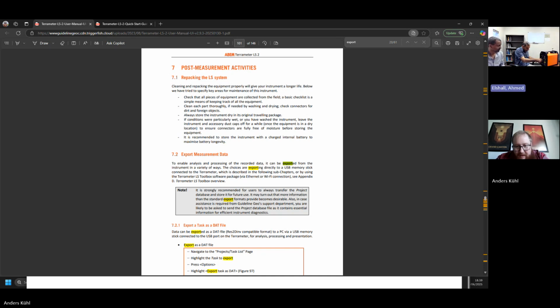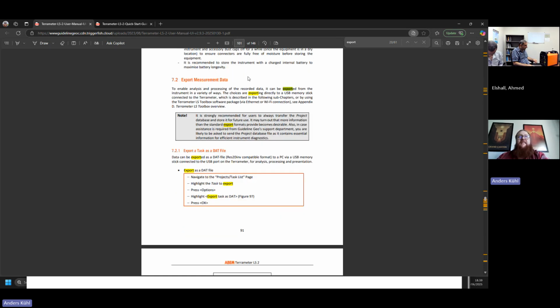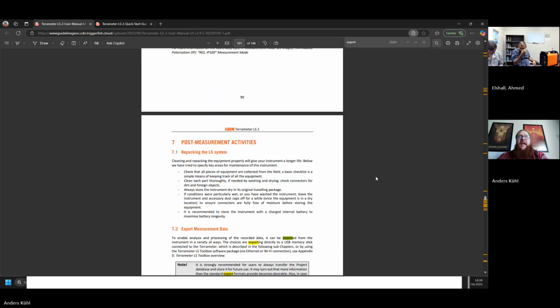You can use the Ethernet slot or the USB slot. You can also connect with an Ethernet cable and use its IP to connect. But if you have the USB, you can put it in there and then export a project to it. The export procedure is explained in detail in the manual. But let's say you've done that. Okay. So what's the difference between, I mean, these two are the same? Yeah? These two are the same, right? Yes.